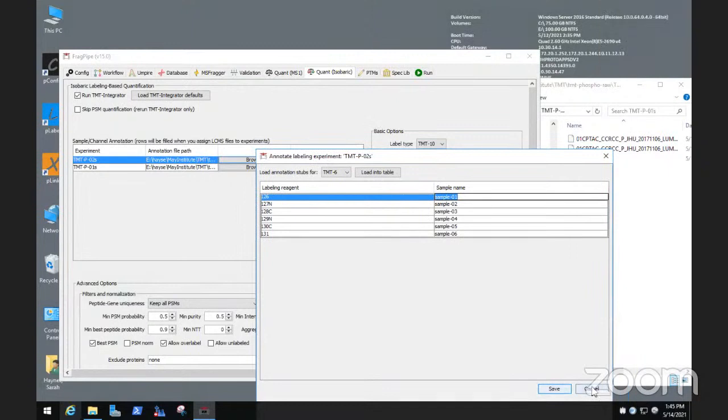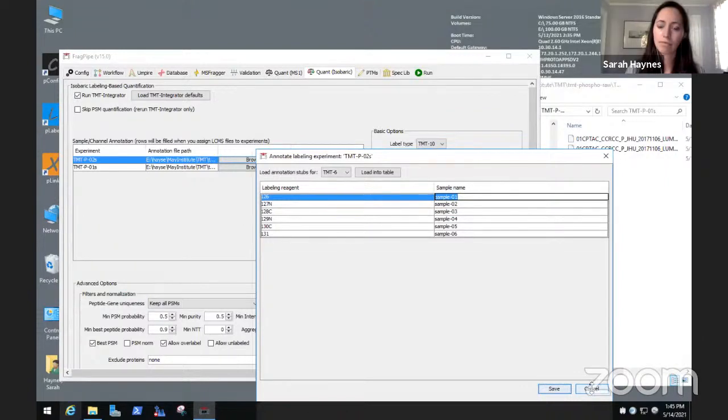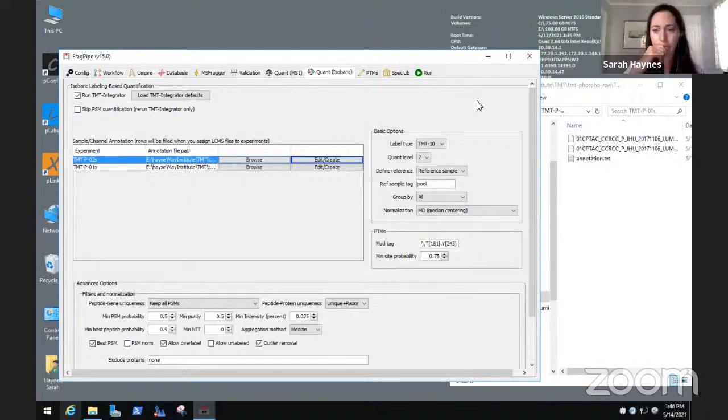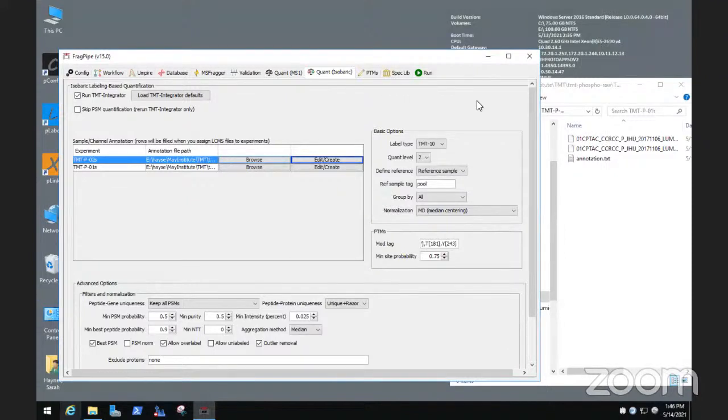When you work with something like CPTAC, imagine that we have 23 plexes, each one has 25 fractions. Here, this is just 2 fractions for each plex because we wanted a shorter data set for tutorials. But it doesn't matter how many files you have, it matters that you have 23 plexes. You're not going to go manually annotating all of this, right? So it's easier to create them in advance and place in each folder along with the mzML or raw files.